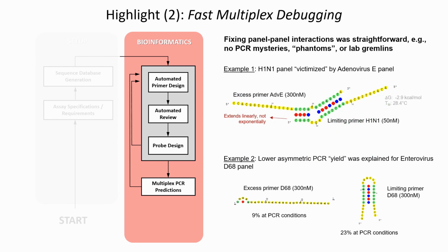Another important highlight was when we put everything together. So obviously, computationally, initially we checked that there's no primer dimer, and none of those things happen, and that was the easy part of it. When you generally put the multiplex together, some of the panels would not get annihilated, but the efficiency would change a little bit. Some of them, 10%, 15%, yields will go down. So you would lose the pristine singleplex quality of it.